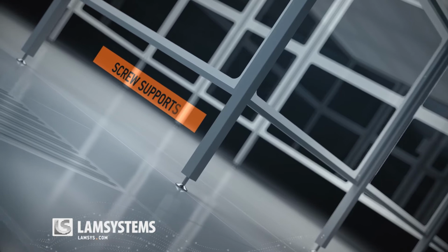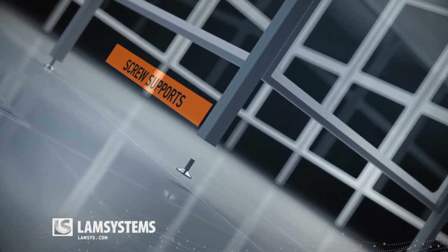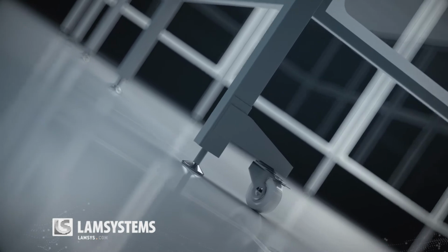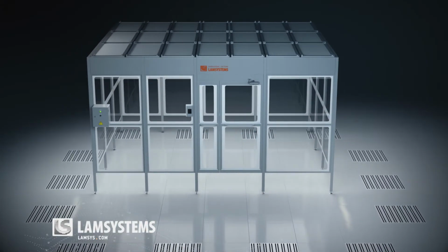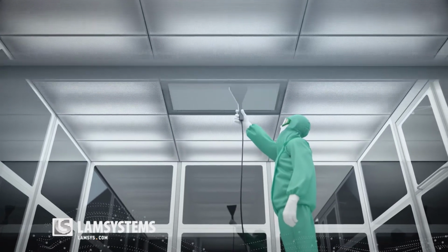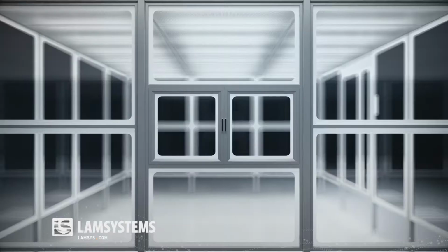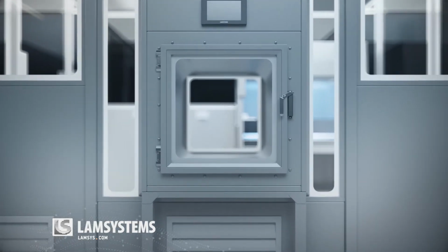Frame stands are featured with screw supports that allow compensation of any inequality of the floor. Small clean zones can be equipped with removable caster wheels for easy installation at operating site. Continuous or regular relocation of the clean zones is not recommended, since each relocation requires HEPA filter integrity testing. The enclosures can be equipped with required number of doors, openings, windows, and gates for personnel and equipment transferring.